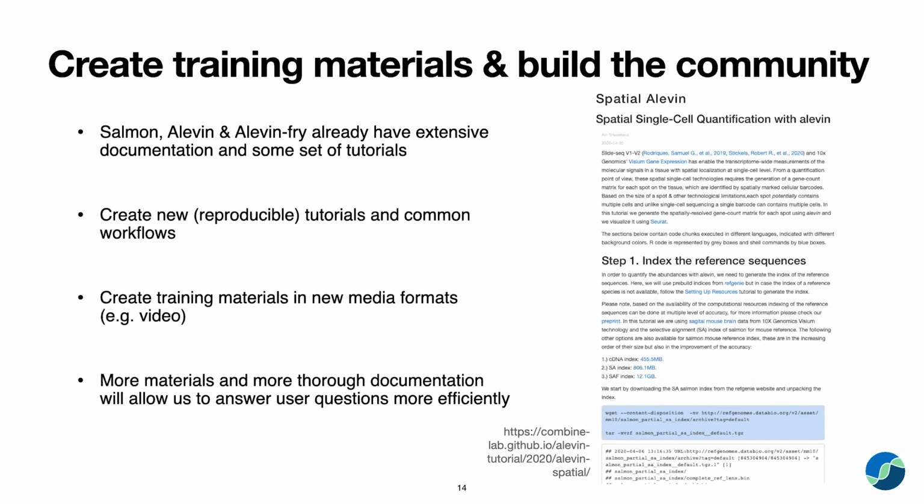On the right of the slide here is the beginning of one that looks at doing spatial transcriptomics with Alevin. But there's a huge number of use cases people are interested in applying these tools to where there's not good documentation. So we're going to create additional tutorials, common workflows, and training materials in things like video and other mediums.